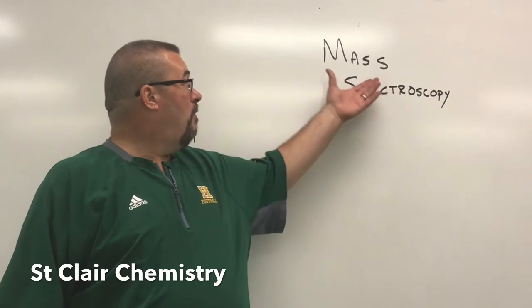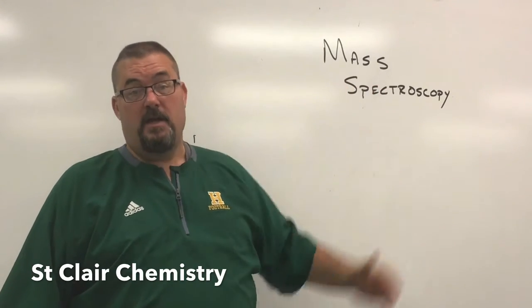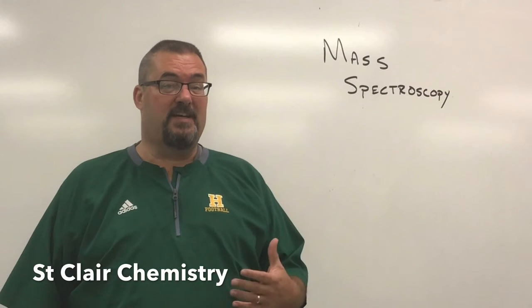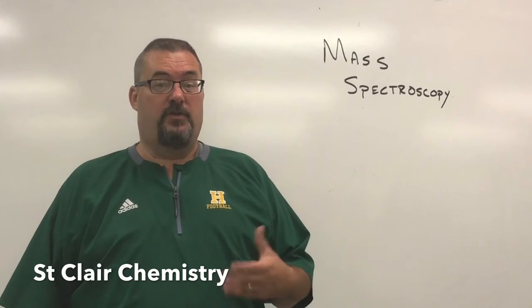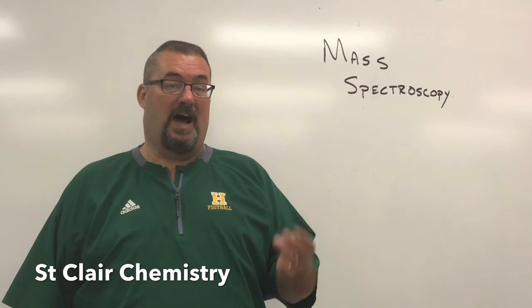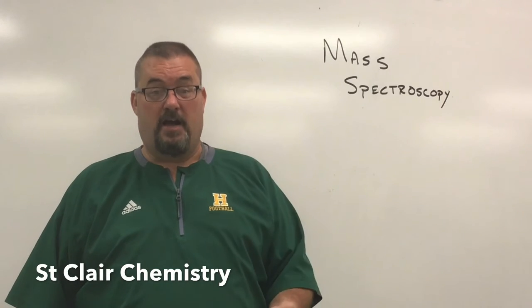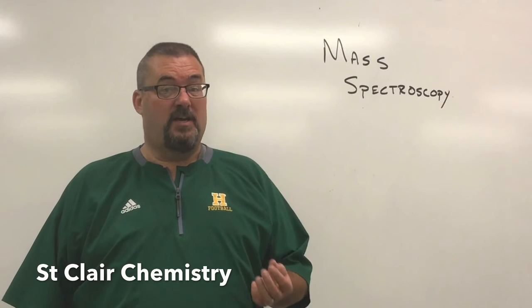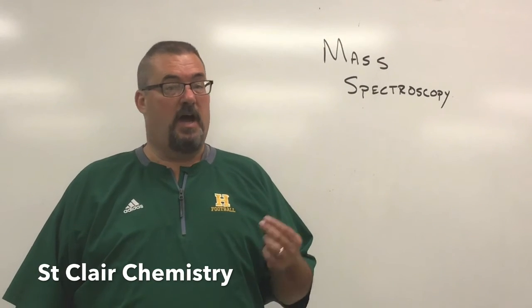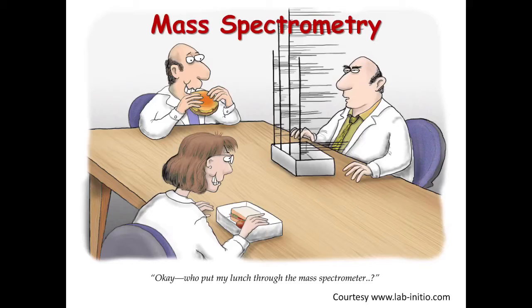In this episode, we're going to be talking about mass spectroscopy. Now, mass spectroscopy will tell us or lead us in the direction of determining the masses of elements, isotopes, and compounds, and looking into their structures. It's really an interesting subject. I hope you enjoy today's episode.